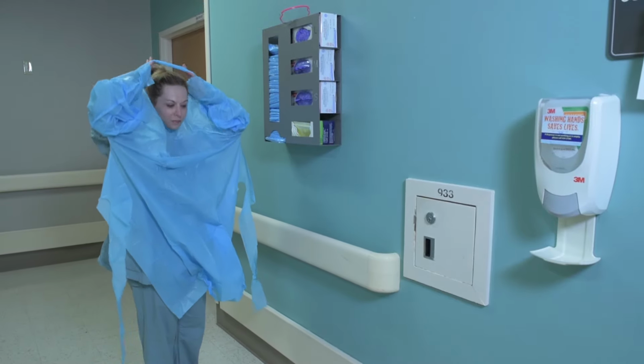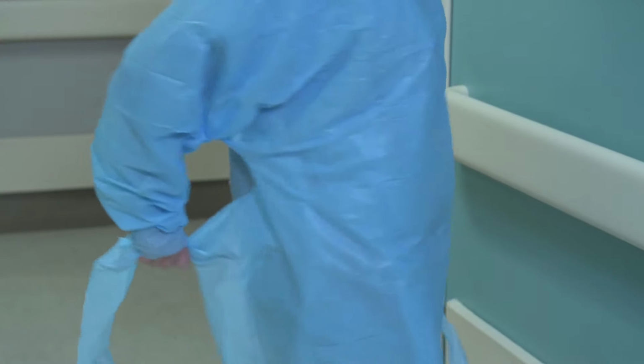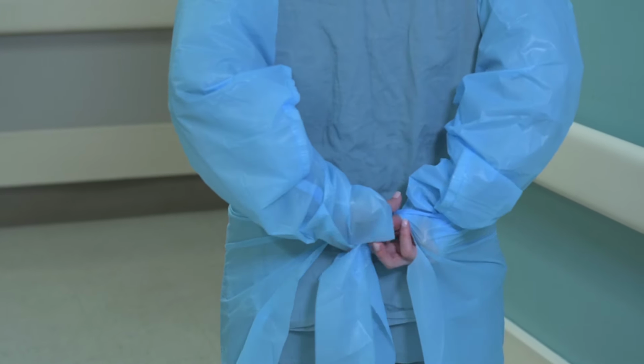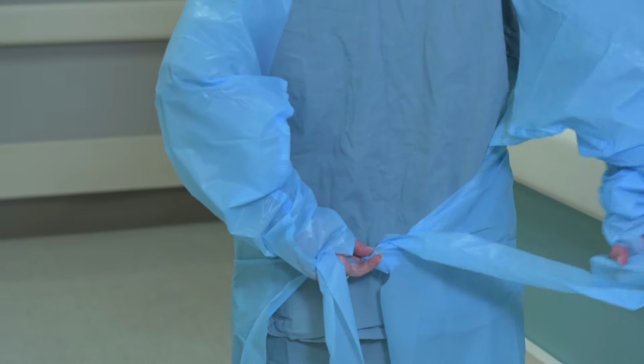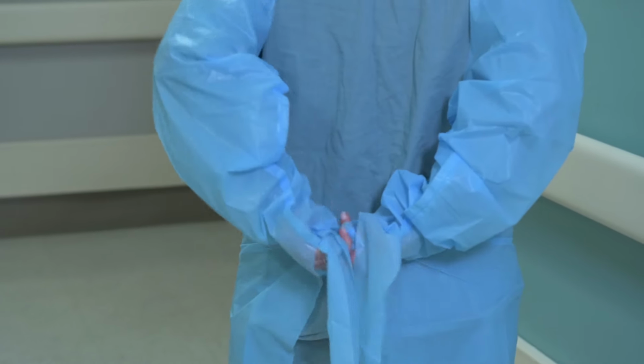Put on the gown over your head and tie in a bow behind your back. Do not tie in the front because this can contaminate your hands later when removing. Expect the front of your gown to get contaminated while working with the patient.